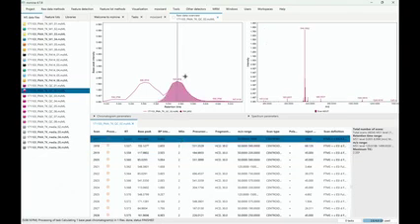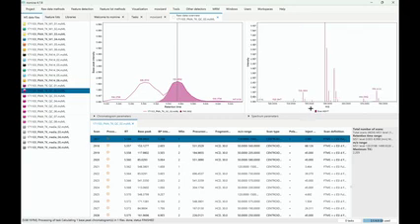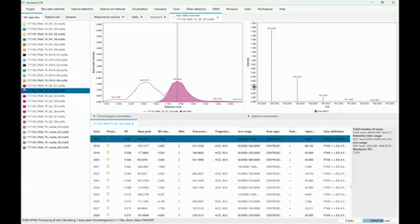So if we click on any of these data points, you can see the spectrum. I can zoom in. And of course, one thing we might want to make sure is whether it is actually centroid or profile mode data. Honestly, I've seen people just process profile mode data as if it was centroid mode data.